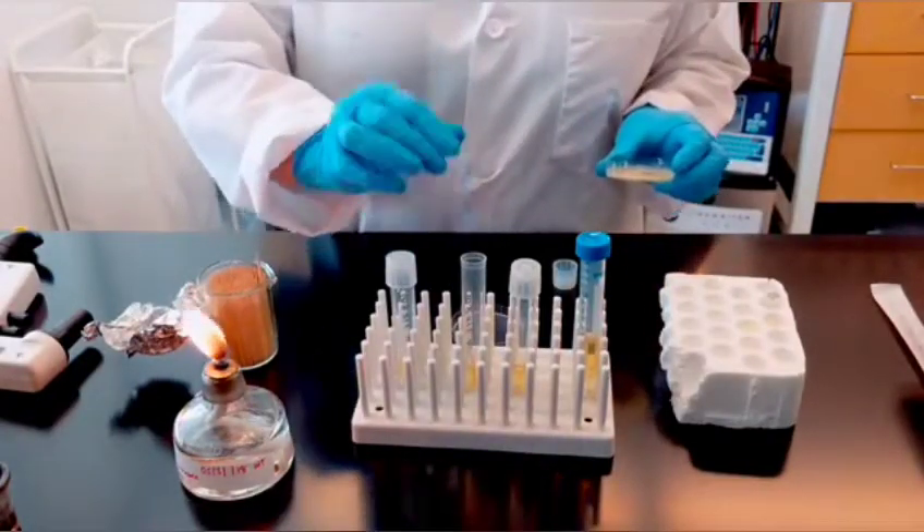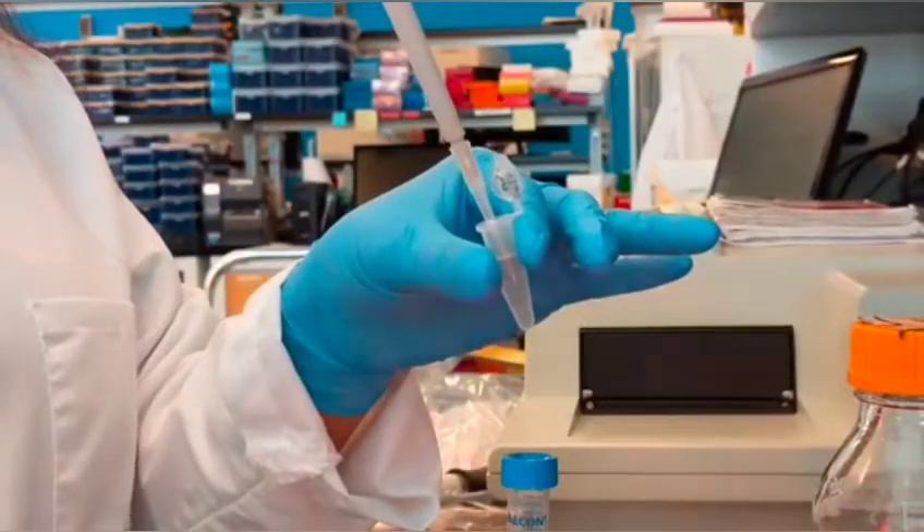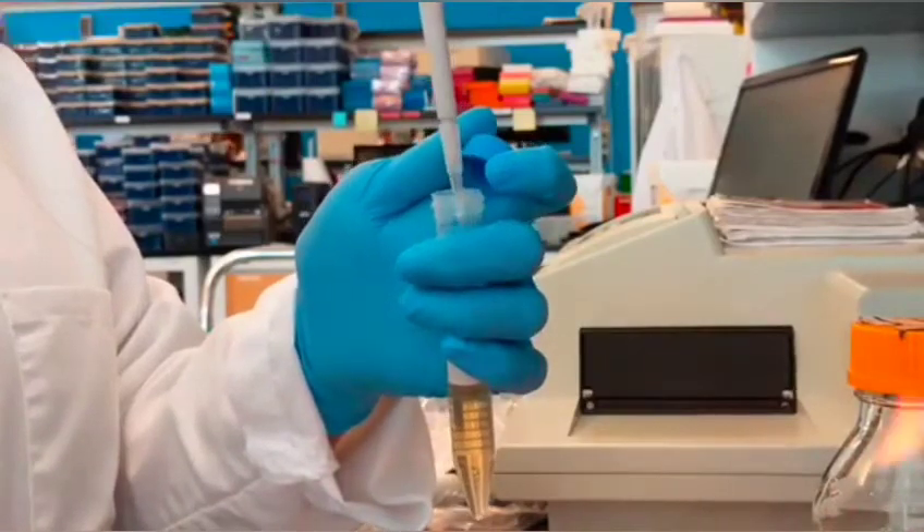Inoculation is the process by which you introduce bacteria into liquid media. In this video, we will demonstrate best practices to perform inoculation, ensuring sufficient numbers of bacteria for plasmid DNA isolation.